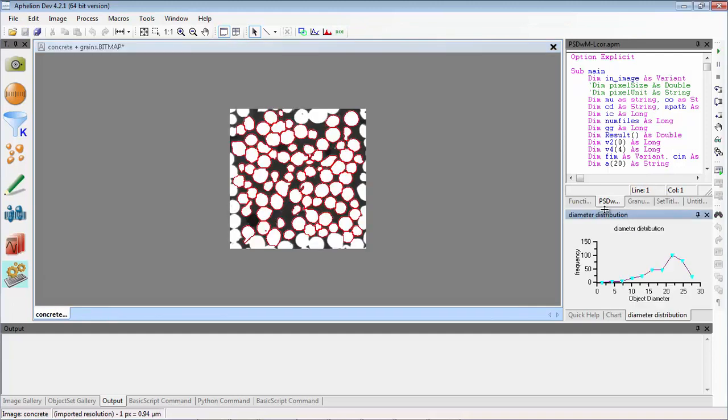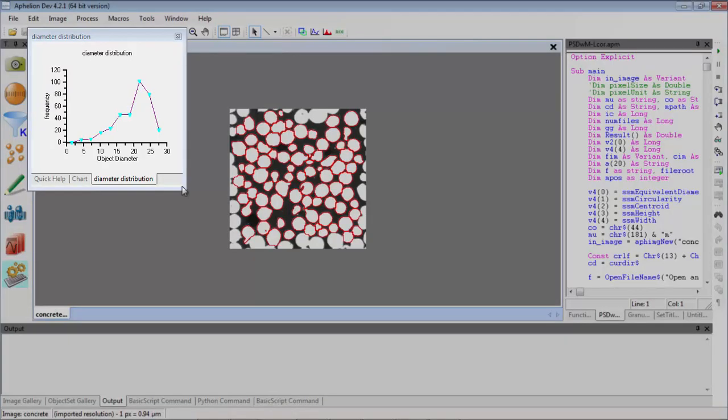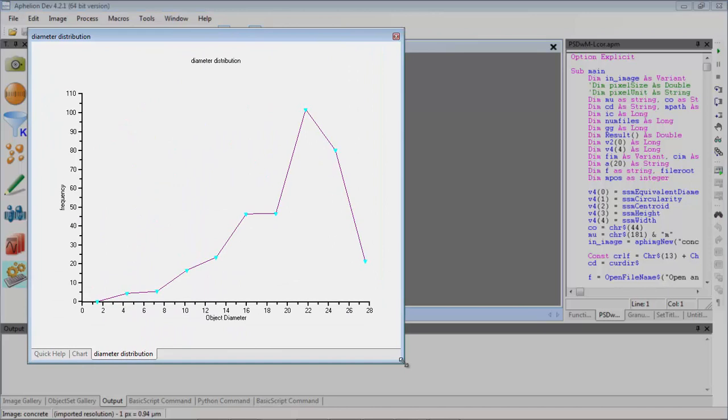In just a few seconds, the entire analysis is completed and the results are displayed. These results have had a statistical correction applied to eliminate the bias in the distribution that is introduced when removing objects which are touching the borders.